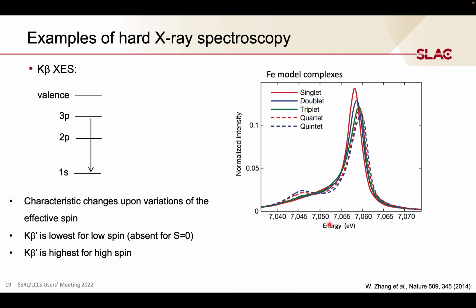And if you want to do it more quantitatively, there are also methods like the integrated absolute difference, the IAD method, or you look at the first moment of the Kβ1,3, or look at difference spectra as is usually used for time-resolved measurements.